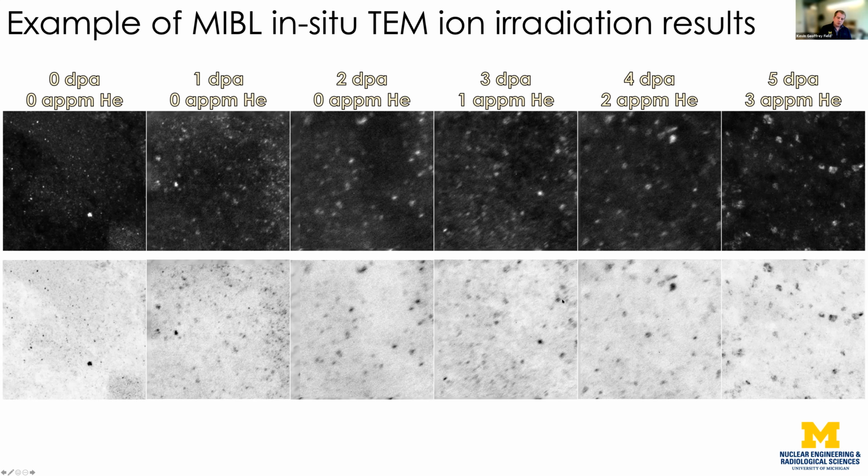And so what my graduate student is trying to do is ultimately quantify the coarsening events of the precipitates versus the loop formation, and compare that between different cluster densities, right? So you can imagine that if you increase the number of precipitates, you would increase the number of sites that those defects could go to, which would limit radiation damage to the material.